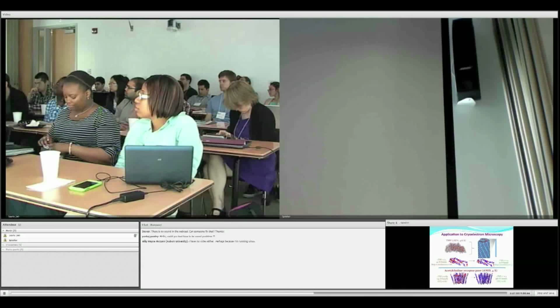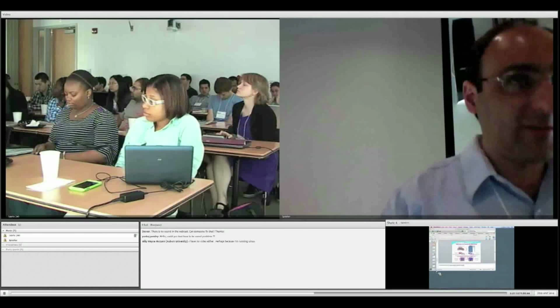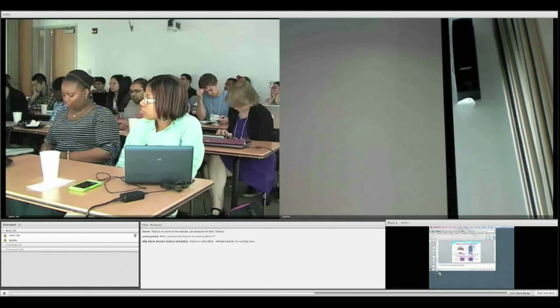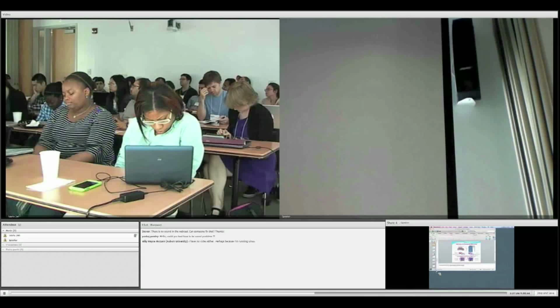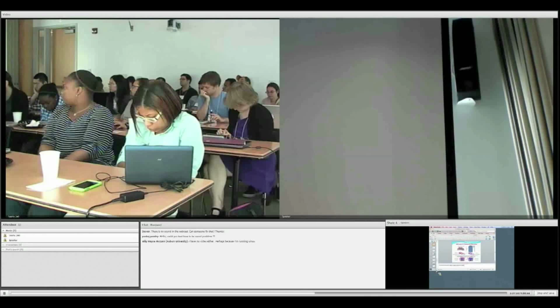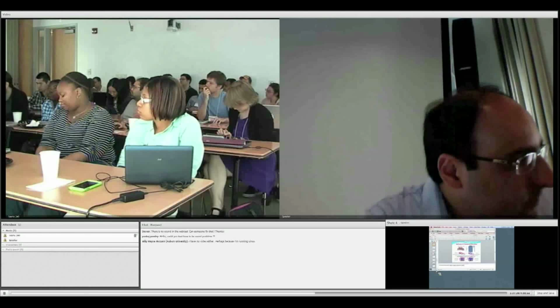And we are working to modify those softwares to fit the improved backbone into the NMR restraints. So the same idea. For example, when we use flexible fitting, we restrain the dihedral angles to a certain degree to not allow them to move away from the improved backbone. We are doing the same for NMR. We restrain the dihedral angles that we improve through the first stage, and then we try to fit it into the NMR restraints.